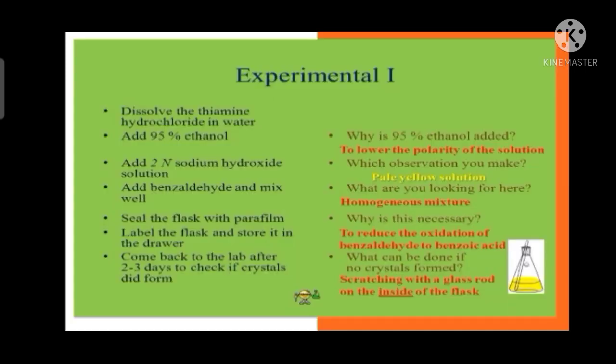Now let us have a look on the procedure of the reaction. The first procedure is dissolve the thiamine hydrochloride in water. The second one is add 95% ethanol to it. Then we will add 2N sodium hydroxide solution to it. Finally we will add benzaldehyde to it. Then we have to mix well the reaction. After mixing well we will seal the flask with parafilm. Then label the flask with anything. Just label it and store it in the drawer. Then come back to the lab after 2-3 days to check if crystals did form.